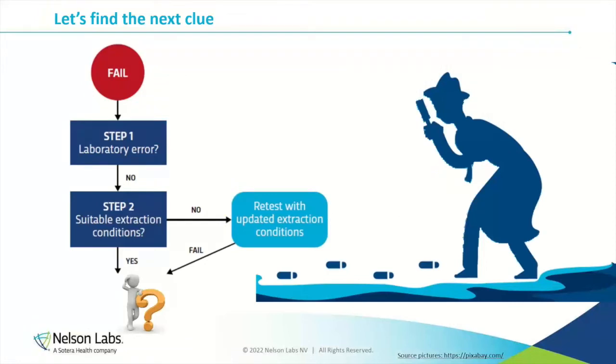It's possible that even a retest with the updated extraction condition, you still have a fail, or from the beginning with your original fail, all the extraction conditions, the parameters were fine, were okay for your device. There was no justification or no reason to actually make them less stringent, less worst case. So that's also an option.